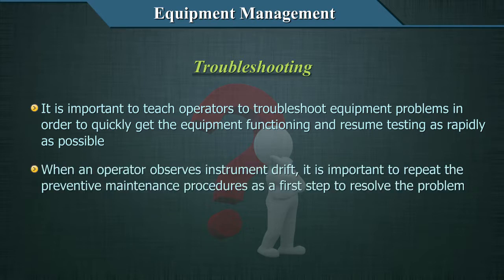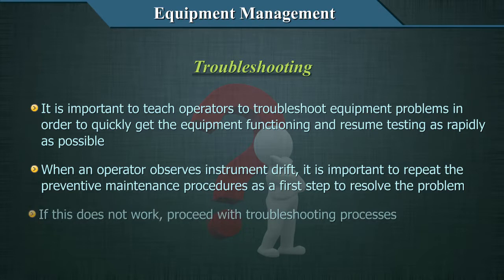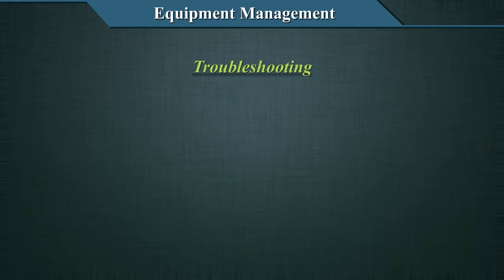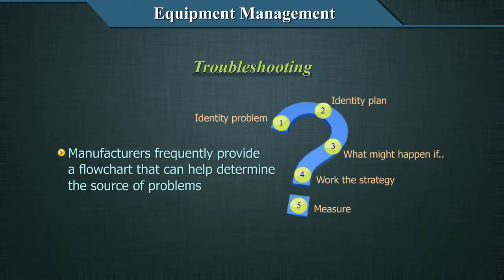When an operator observes instrument drift, it is important to repeat the preventive maintenance procedures as a first step to resolve the problems. If this does not work, proceed with troubleshooting processes. Manufacturers frequently provide a flowchart that can help determine the source of problems.